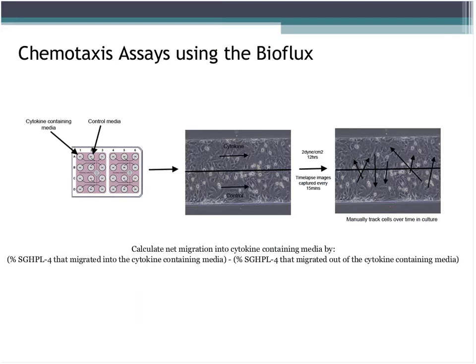Okay, so the next thing we wanted to look at was the fact that if we've shown that trophoblasts aren't migrating retrograde to flow, but are migrating with flow, how, in fact, are those trophoblasts then going down the arteries, and why are they going down the arteries? And so if it's not a result of them being stimulated to migrate retrograde to flow, maybe it's something that they're being attracted to down the arteries.